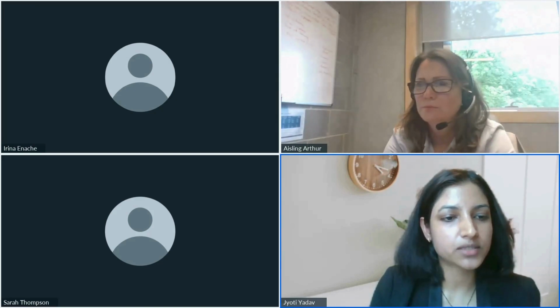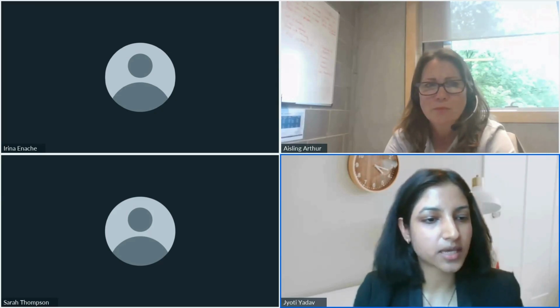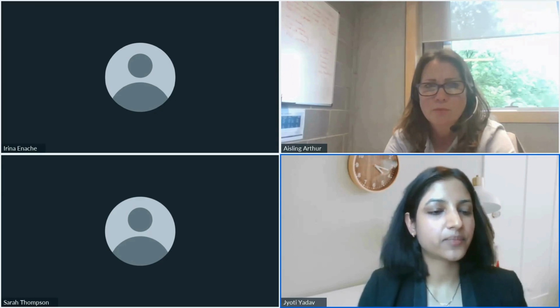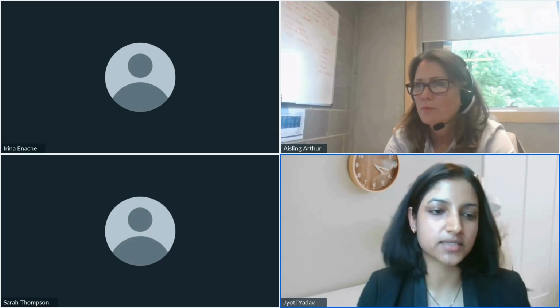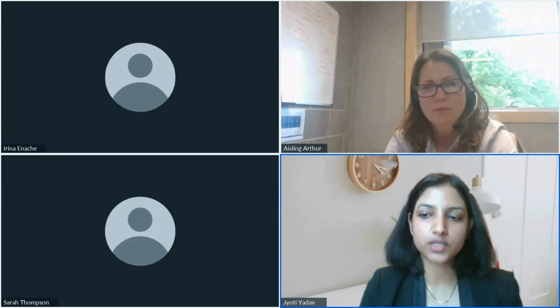Only one side of the crystal is captured, which is fed to the AI model. Only one side. Does that mean it is not a 3D structure? I'm not exactly sure, because the AI model works with the instrument.